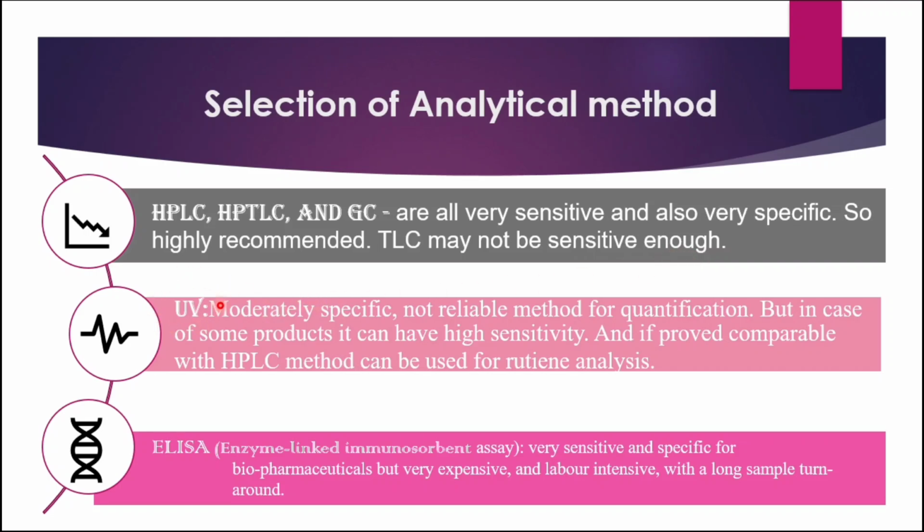As an usual or as an Indian industrial practice, UV method is usually preferred, but this method is moderately specific, so not a reliable method for the quantification. But in case of some product, it can have high sensitivity, and if proved comparable with the HPLC method or HPTLC method, you can use this method for routine analysis or cleaning validation, residue or swab testing, right?